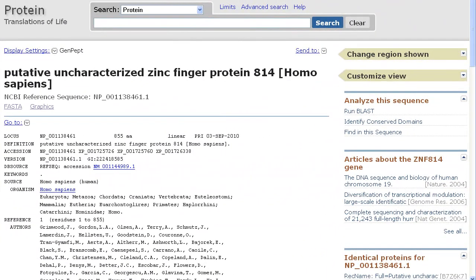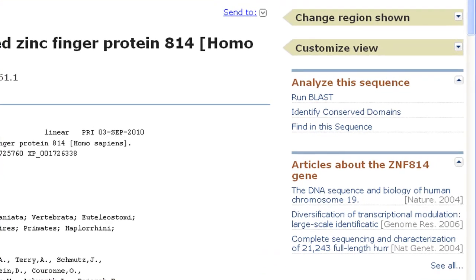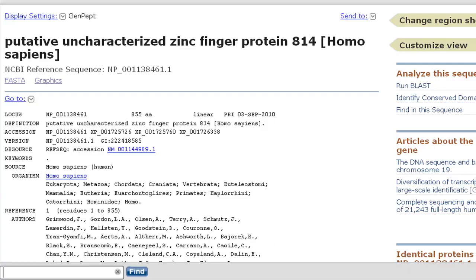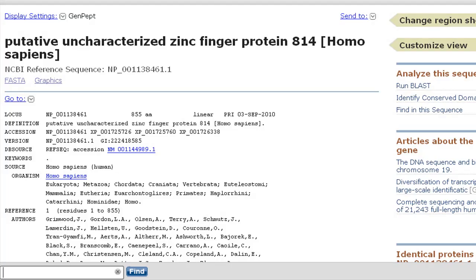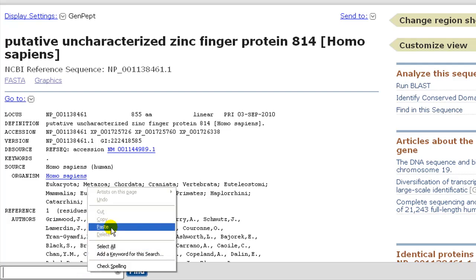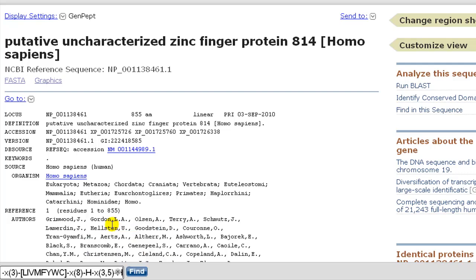Here are a few examples, starting with a PROSITE pattern. Let's say you've found this record for a putative zinc finger protein containing 23 zinc fingers and you'd like to see their distribution. Click the link findInThisSequence and notice the input box near the bottom of the page. I'll paste in the PROSITE pattern for C2H2 type zinc fingers and click find.